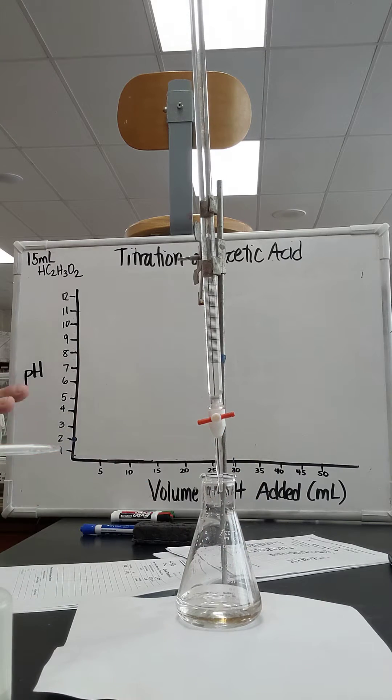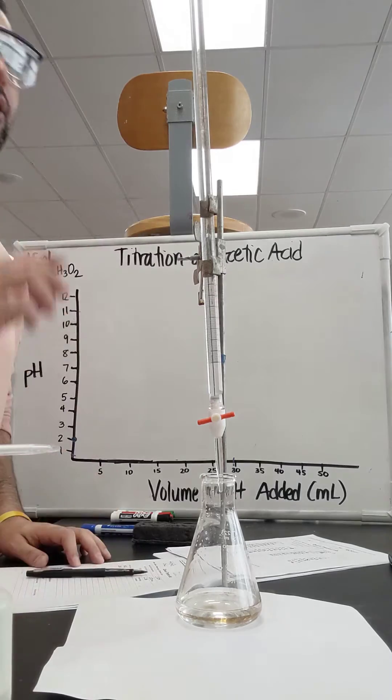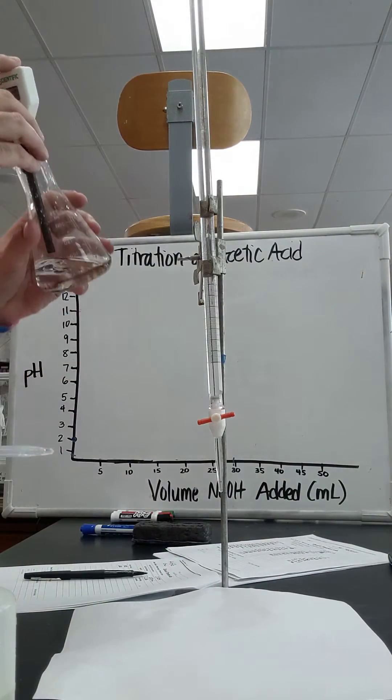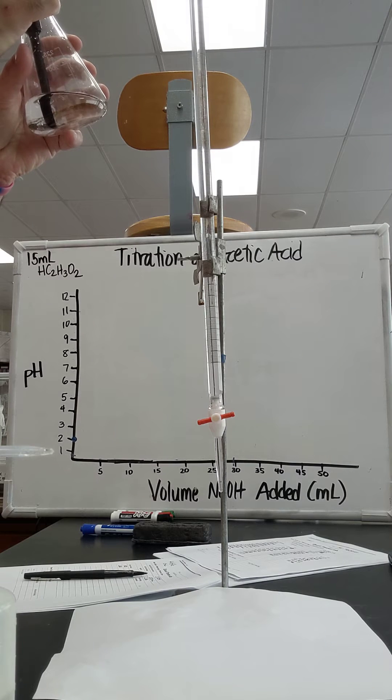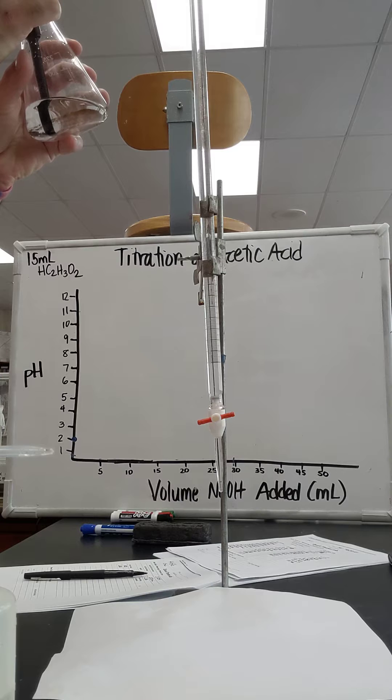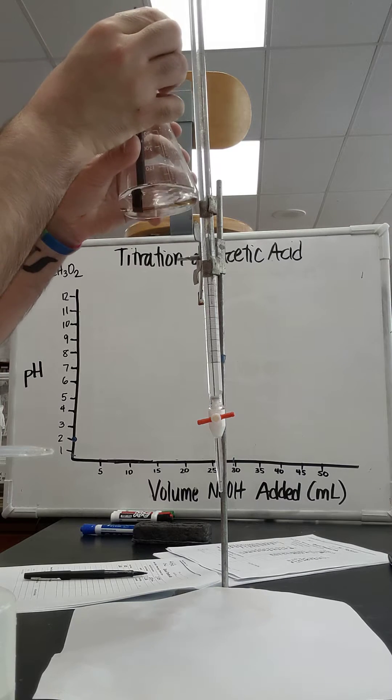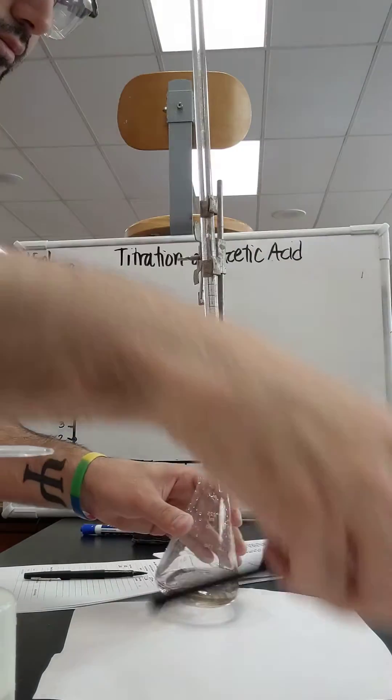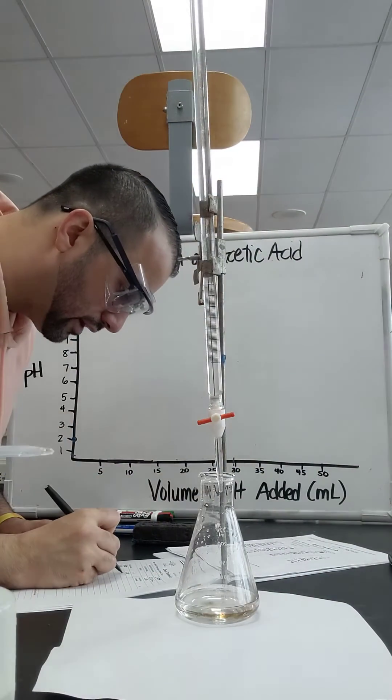Wow, 2 milliliters and I saw a lot of pink color. I have it exactly at the 2 milliliter mark. Now I'm going to quickly record the pH. Looks like the pH is 3.0. Oh my, that's jumping. It keeps on going. Looks like the pH is about 3.96. So 3.96 is the pH.